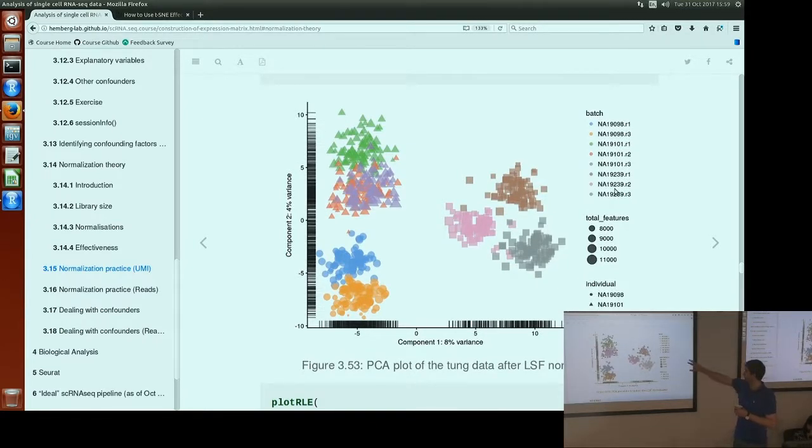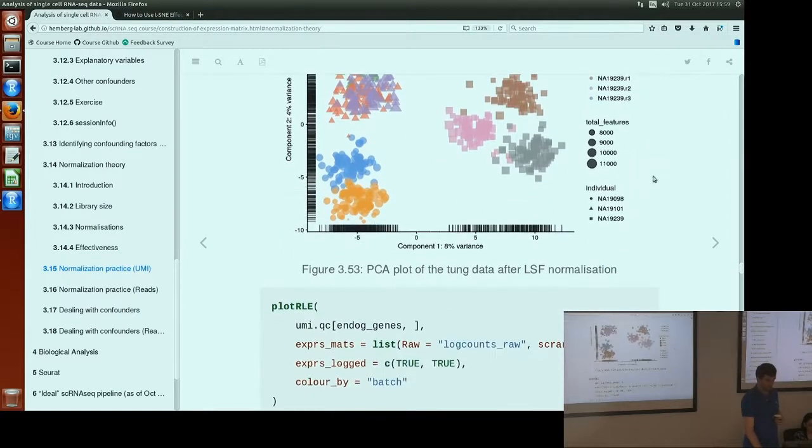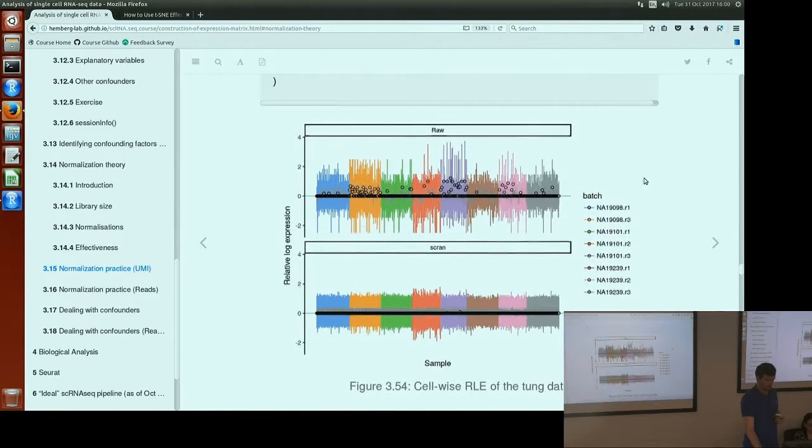We've still got three very distinct batches for that particular individual on the right-hand side. We're getting a bit more distinction perhaps between the triangles and the circles here. The different batches for the triangles are starting to overlap a bit more, which is what we'd like to see. Those two in the bottom left corner are still distinct batches, but a bit closer together than with some of the other methods perhaps. So again, not a profoundly different story, but a big improvement over not doing any normalization.